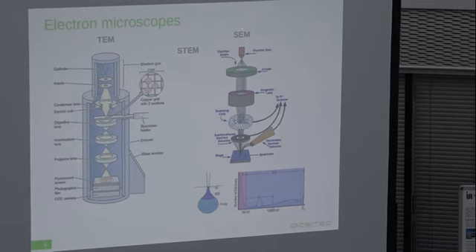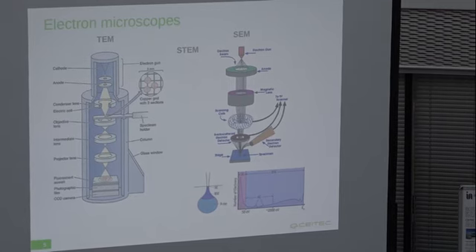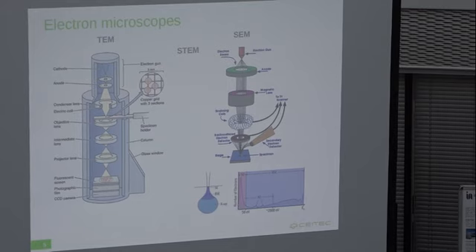Specifically in the scanning electron microscope, there are two types of electrons we primarily detect. These are secondary electrons generated at the very surface of your specimen, and they primarily bring information about the morphology of your sample. These electrons have very, very low energy.